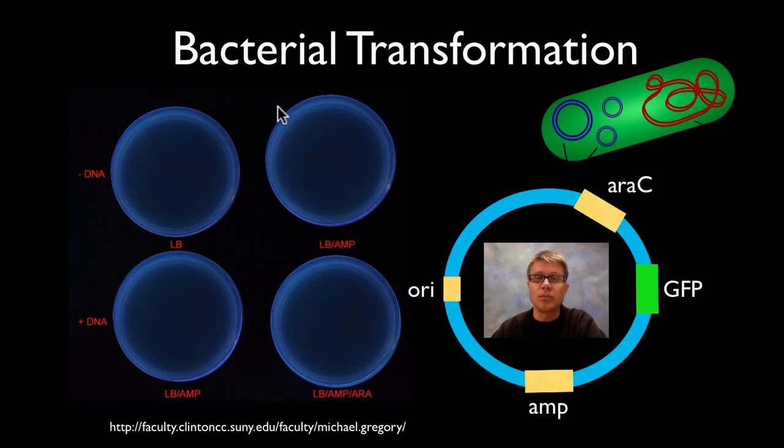The bacterial transformation we're doing is using a plasmid. This is the plasmid right here. It's called P-glow. Basically, P-glow is a section of DNA. So in a bacteria, they're going to have their regular DNA, but they're also going to have these little bits called plasmids. Plasmids give them ability to do something. So a fertility plasmid would be an example, or resistant plasmid. So that's going to be one that gives bacteria antibiotic resistance.